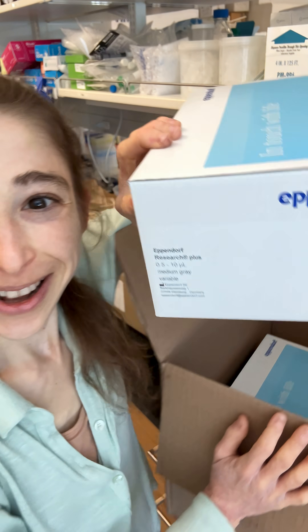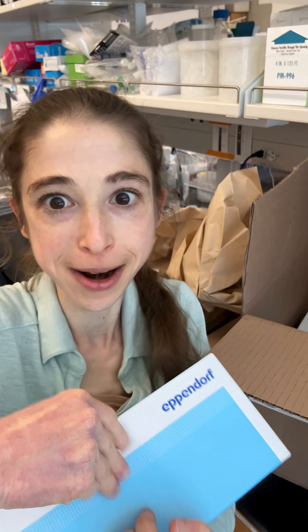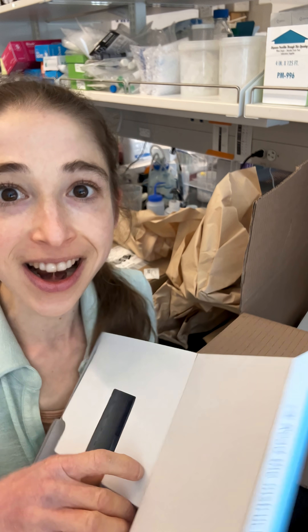My pipettes are here. P-10! A P-10, or a 10 microliter pipette, is my absolute favorite, and there were none here.